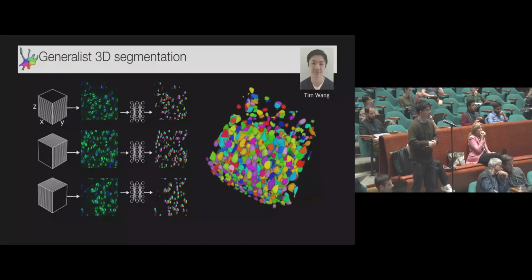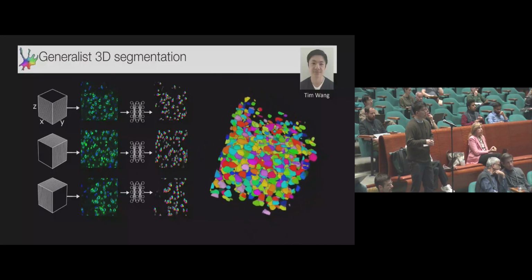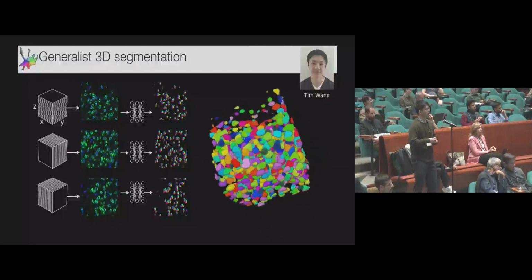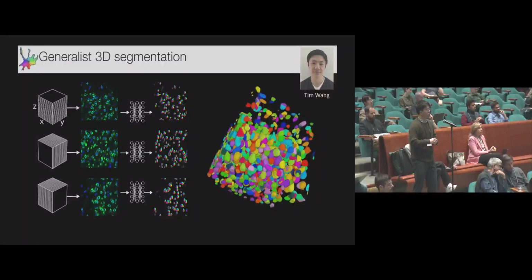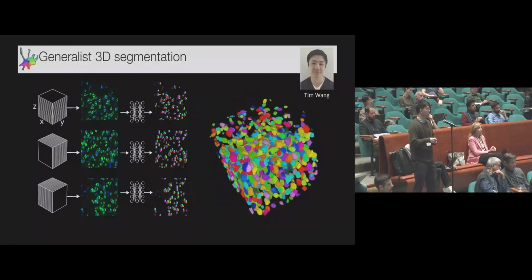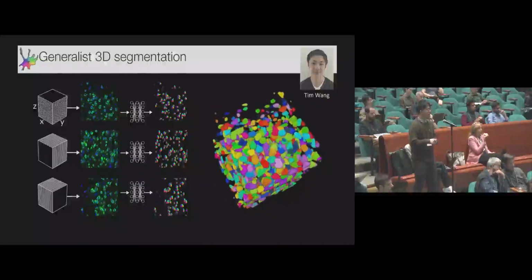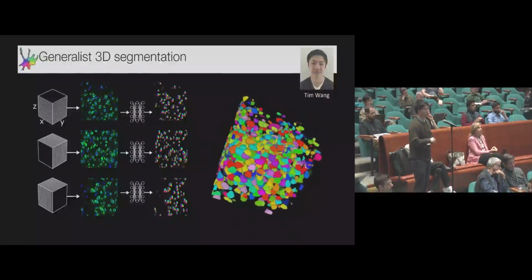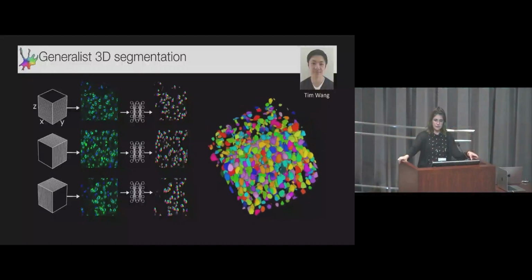Actually, this is a supplemental figure in the Cellpose 3 paper, and I've started doing it for this model too. You can run it on the blurry images. You can either do restoration, where you upsample in Z and restore, or this model seems, from what I found, to be working well out of the box on anisotropic images. Yeah, it's a good question. Thank you.